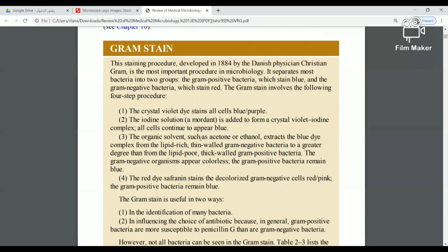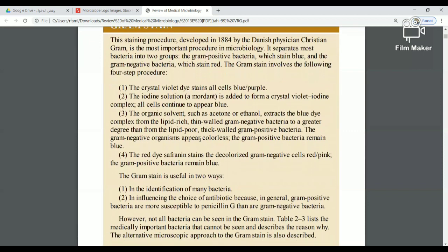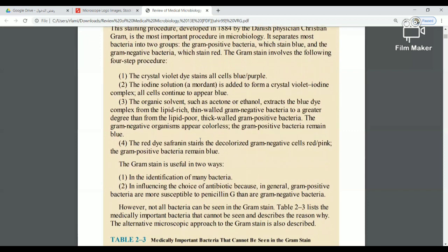Now, what are the steps? First, I apply crystal violet — a blue or purple dye. When I add crystal violet, both Gram-positive and Gram-negative bacteria stain blue or purple at this stage.